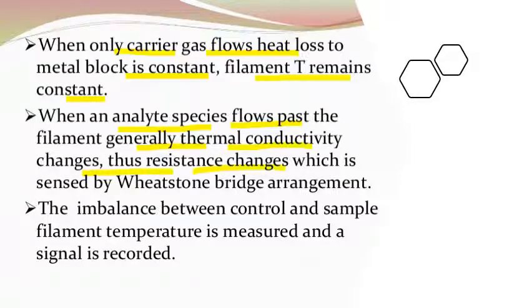Thus, the resistance changes are sensed by the Wheatstone bridge arrangement inside the detector. The imbalance between the control and the sample filament temperature is measured and the signal is recorded. So it detects on the basis of the thermal conductivity change, which produces a change in the resistance, which causes the signals to be produced and recorded.